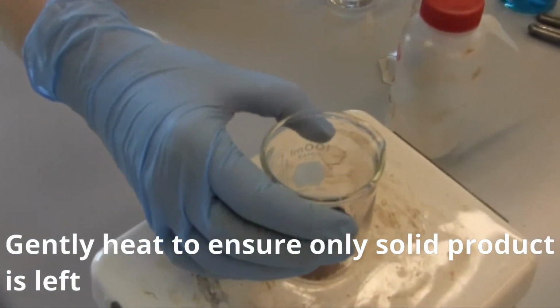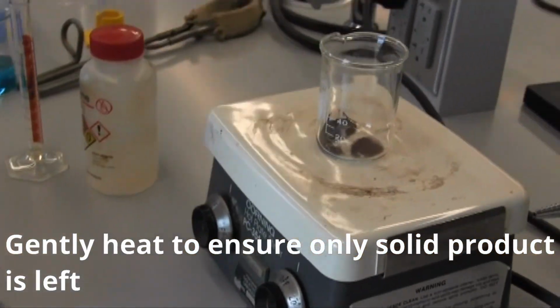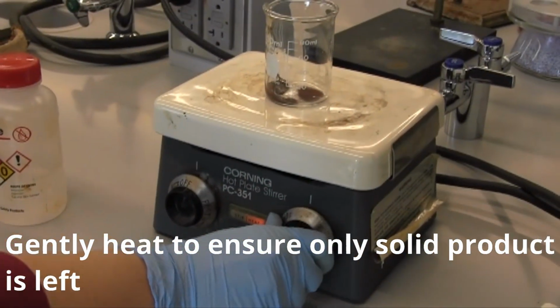Gently heat on a hot plate. Acetone has a low boiling point and can be readily evaporated from the solid.